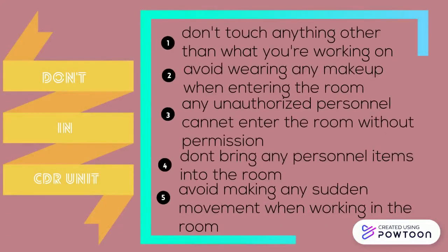Don'ts in the CDR unit. Don't touch anything other than what you're working on. Avoid wearing any makeup when entering the room. Unauthorized personnel cannot enter the room without permission. Don't bring any personal item into the room. Avoid making any sudden movement when working in the room.